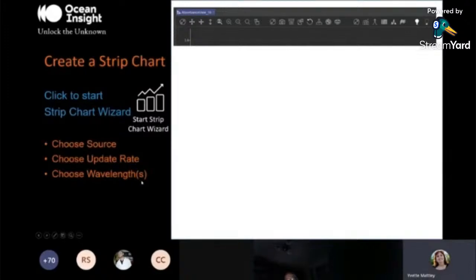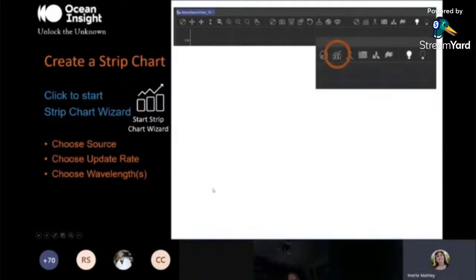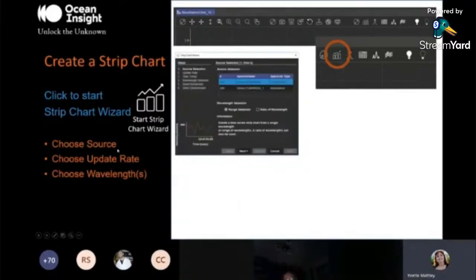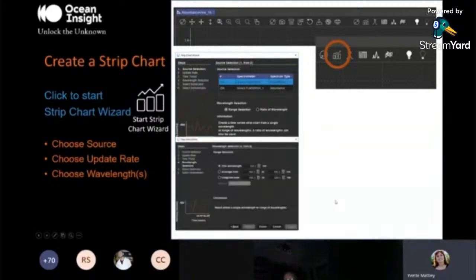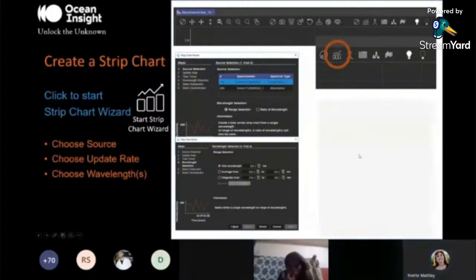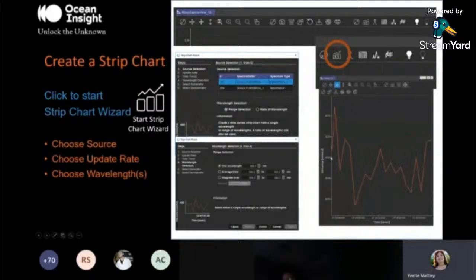Creating a strip chart is useful when you want to look at change in something over time by focusing on a wavelength rather than the entire spectrum. In the graph view toolbar, click the strip chart button to open the strip chart wizard, which walks you through choosing the data source, update rate, and picking wavelengths. Once set, the wizard finishes and your strip chart runs — in this case looking at intensity at 500 nanometers over time. A very nice feature for looking at a smaller subset of your data.